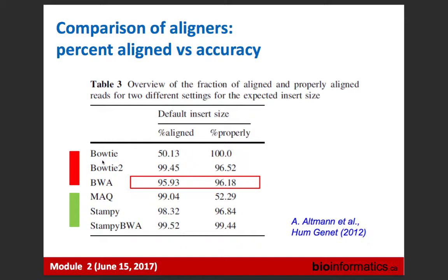How would you do it? How would you answer this question if somebody gave you an aligner? Making a simulated sequence. Exactly. So you take a genome, you shred your genome into those reads, and you can just choose a million arbitrary locations, or you just meticulously shred every single position, and then feed this FASTQ into your aligners, and see how many are aligned correctly and how many are not aligned correctly.